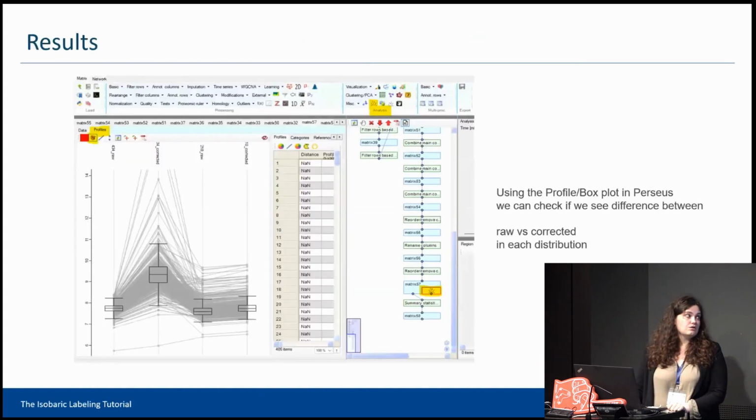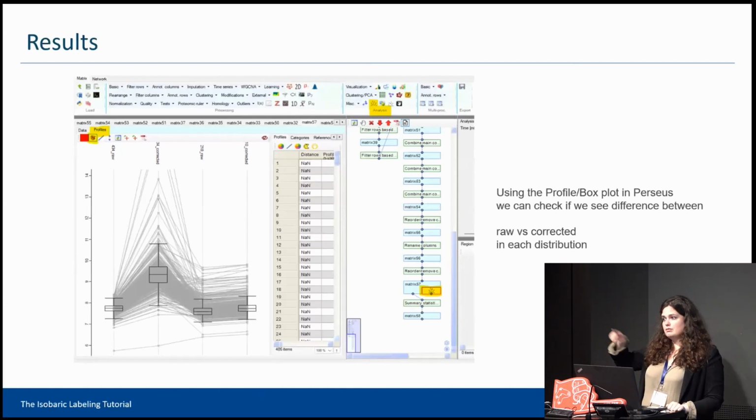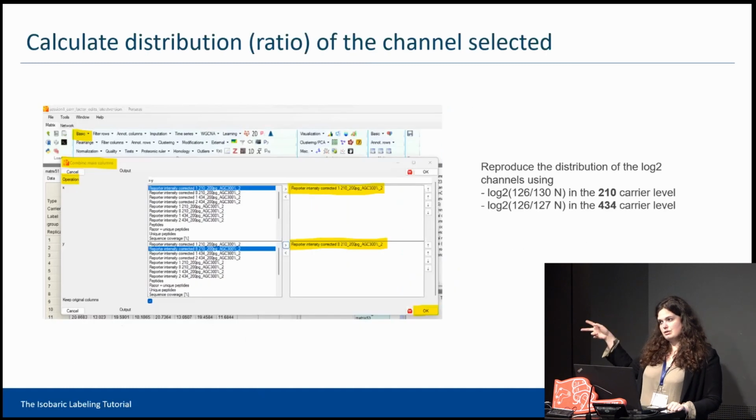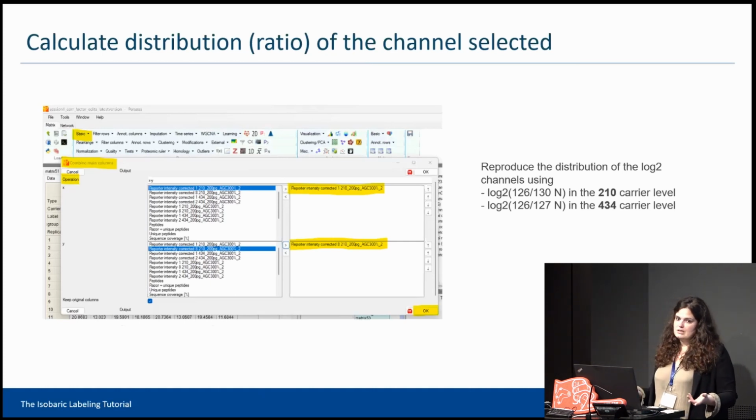How do we do that? We calculate that one for each combination. So it means that we do the combination for the raw one, and for the corrected twice. So 4 times we do this procedure of combination. What we will get as output is exactly the calculation in the matrix. So we will get the subtraction of the two columns, but we want to see the results.